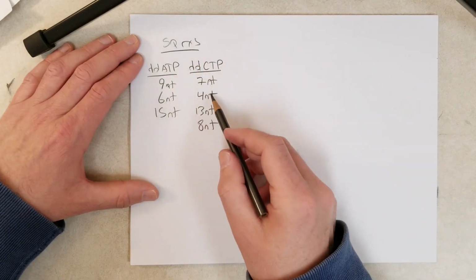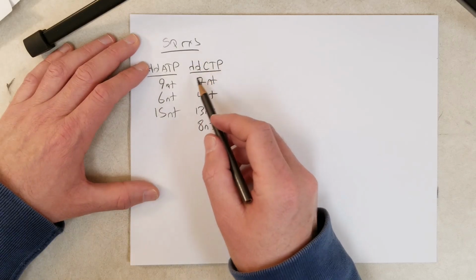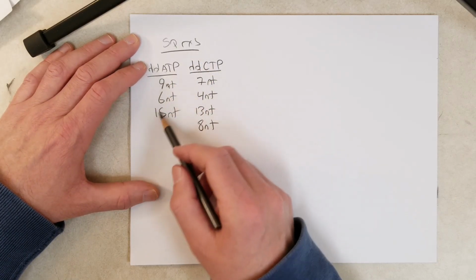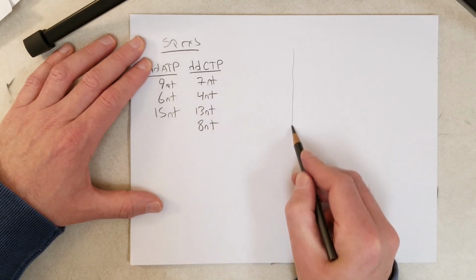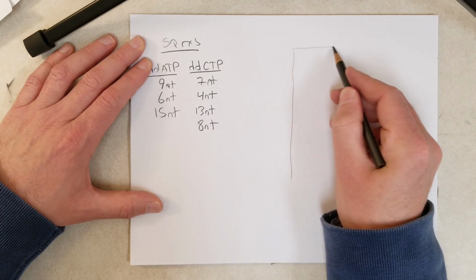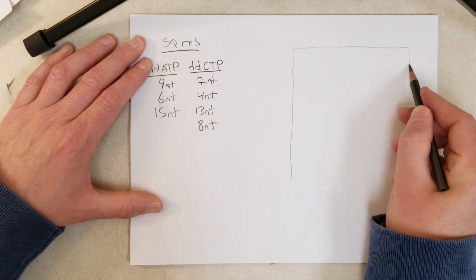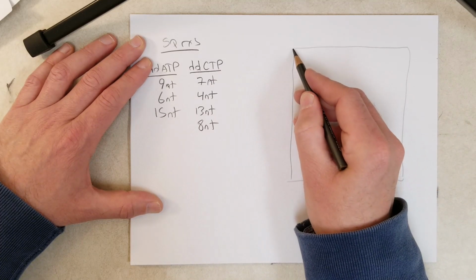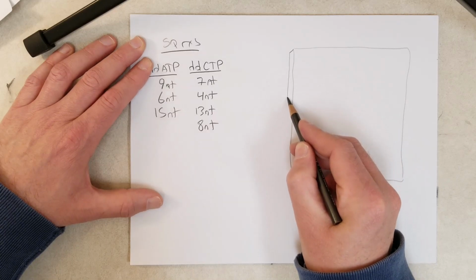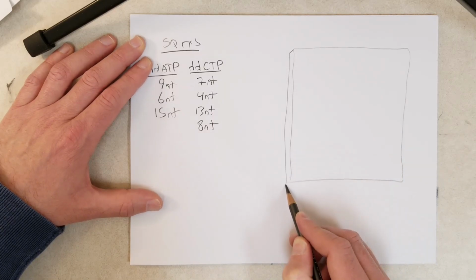Okay, so now when we do our reactions here, we don't know the lengths of the DNAs inside that reaction. What we need to do is do the gel electrophoresis here and determine the lengths of the DNA molecules in that sample.